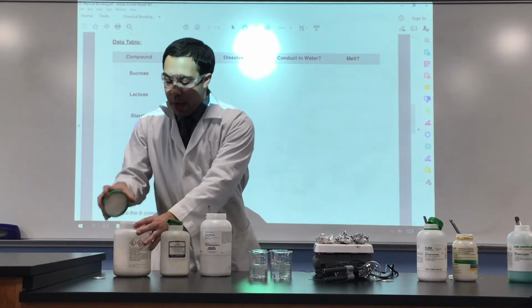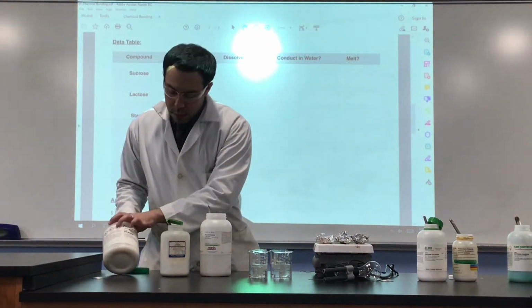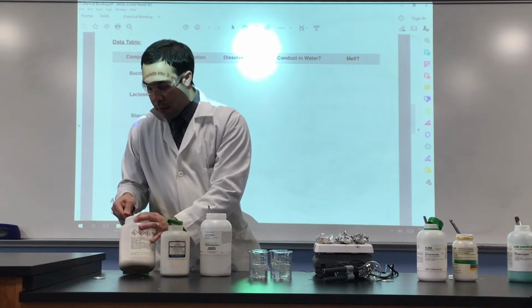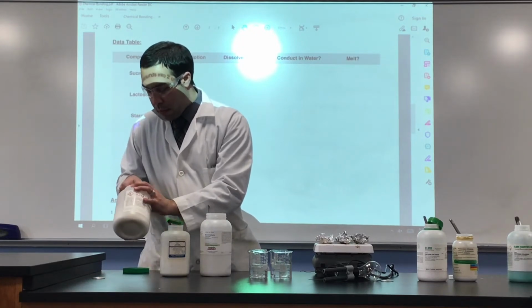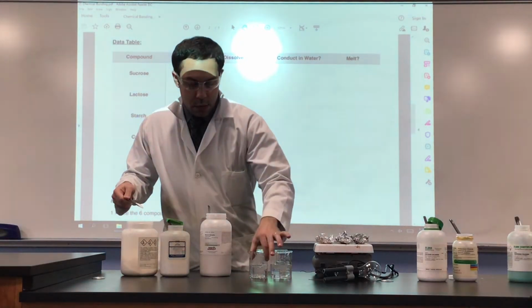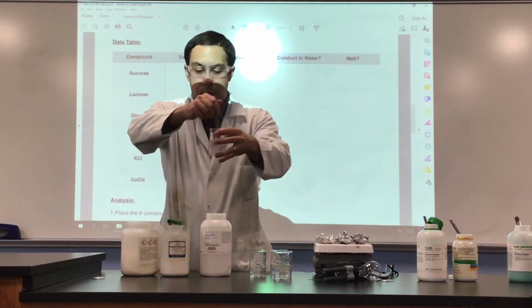So we'll start with the sucrose. Take a scoop.